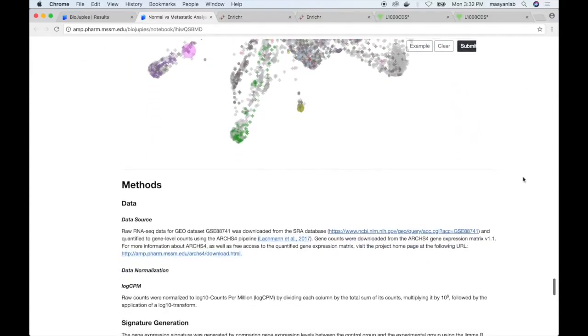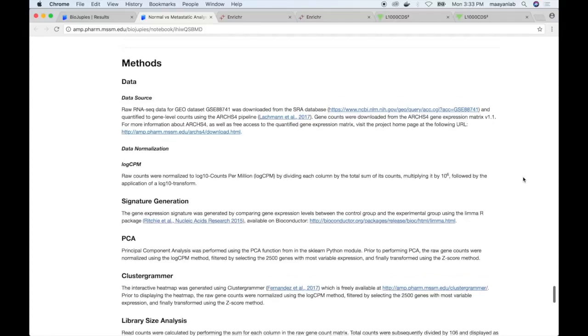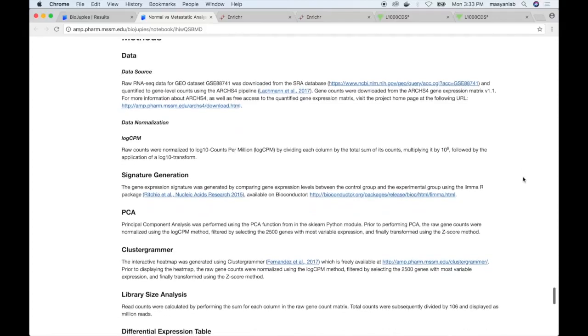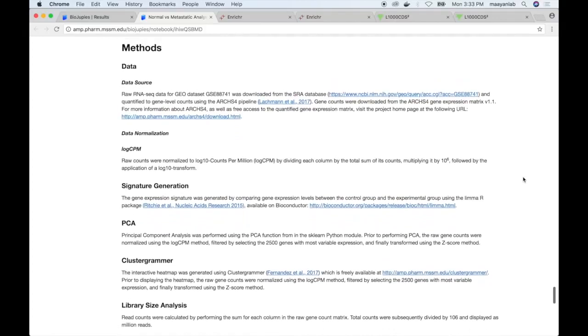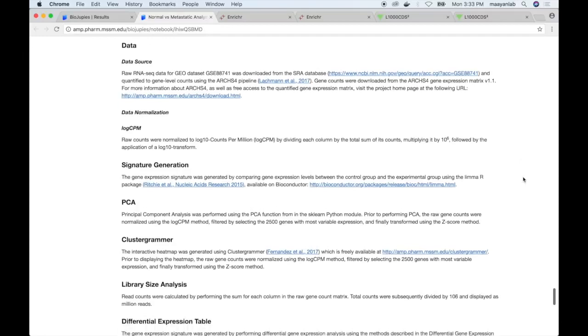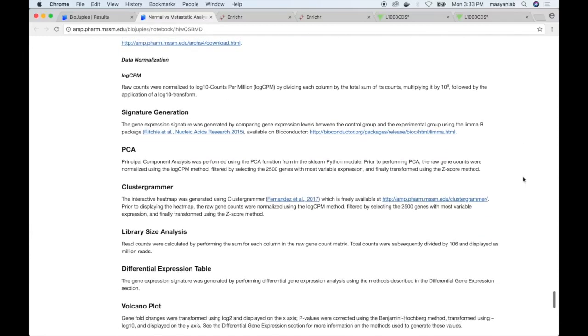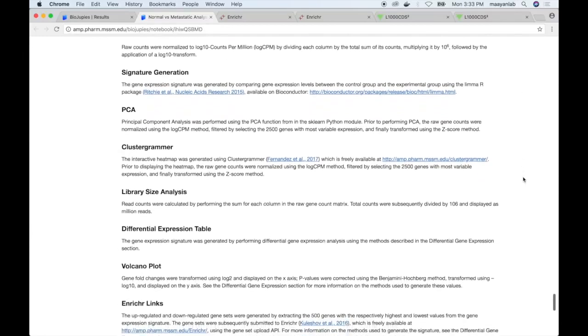The final section of the Jupyter Notebook generated using BioJubbies contains the methods, including a detailed description of the dataset, the normalization techniques and parameters, and references for each of the plugins used to generate the notebook.